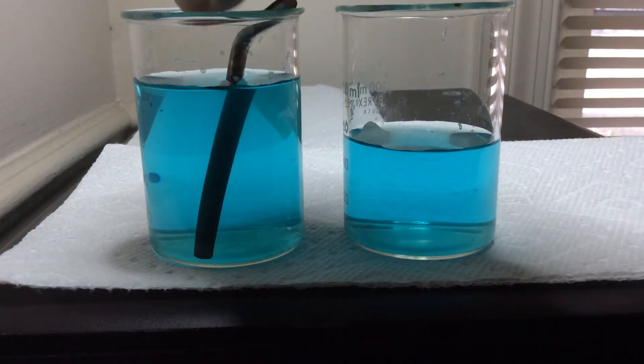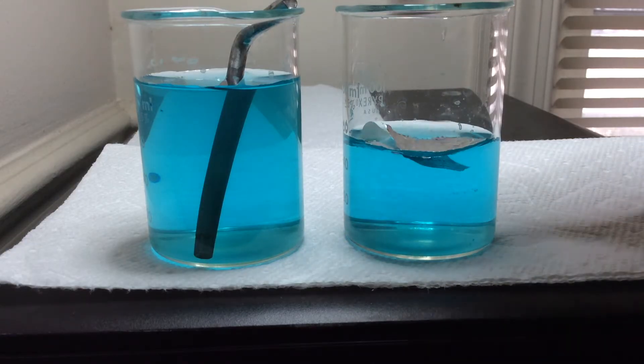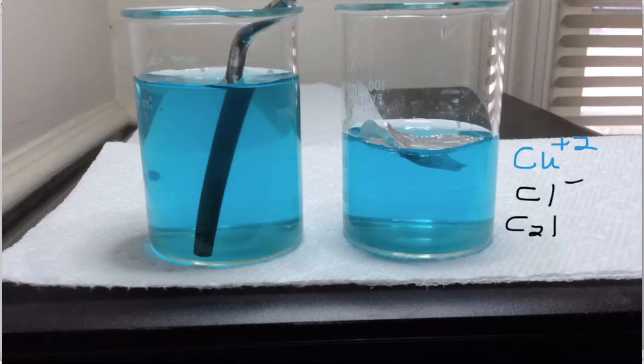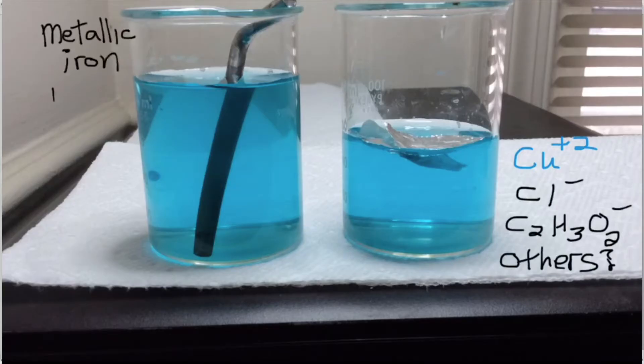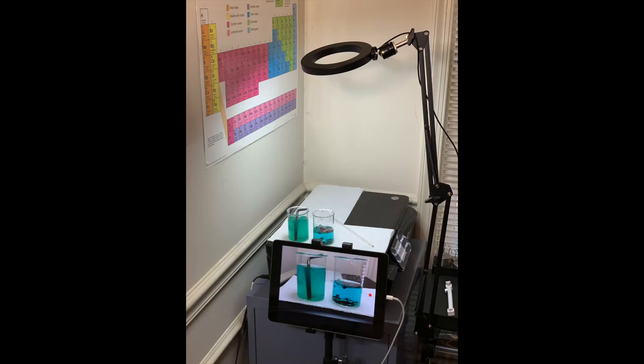I set up two beakers with copper solutions and put an iron Allen wrench in one and some aluminum foil in the other. The blue color comes from the hydrated copper ions, while there are also likely chloride and acetate ions — maybe some others — which are colorless. Then I set this up as a time lapse.